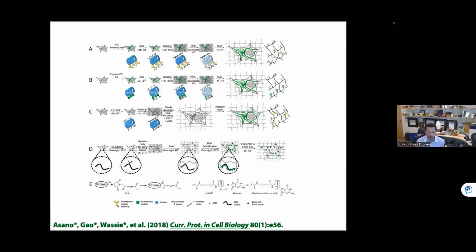Yongxin Zhao, who now is a professor at Carnegie Mellon, with some help from our group, published a sort of rapid expansion pathology protocol that can be down to 4 hours in time. But even the classical procedures can be done in a day and a half or so.